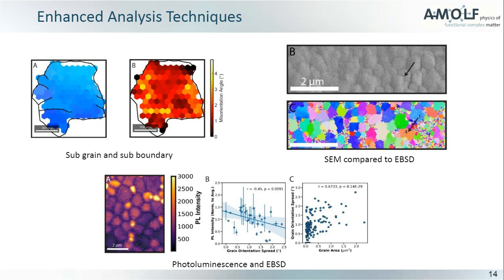You can see this in the first figure. There is a black line in the middle of this blue grain, and on top of this line the orientation is a little bit lower than the orientation below it. So by calculating the misorientation here, we can define this black line as a sub-grain boundary.